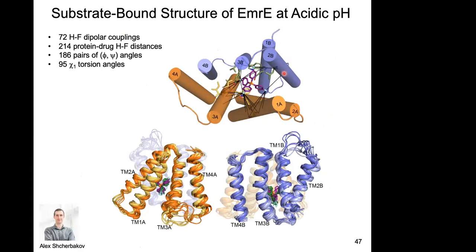And it is known that there are 4 transmembrane helices, but their exact arrangement between the two monomers, the dimer, and displacement between these transmembrane helices, that's the kind of information we want. And by having this drug sitting in a dimer interface, having hundreds of distances, that basically allows us to get the whole structure.